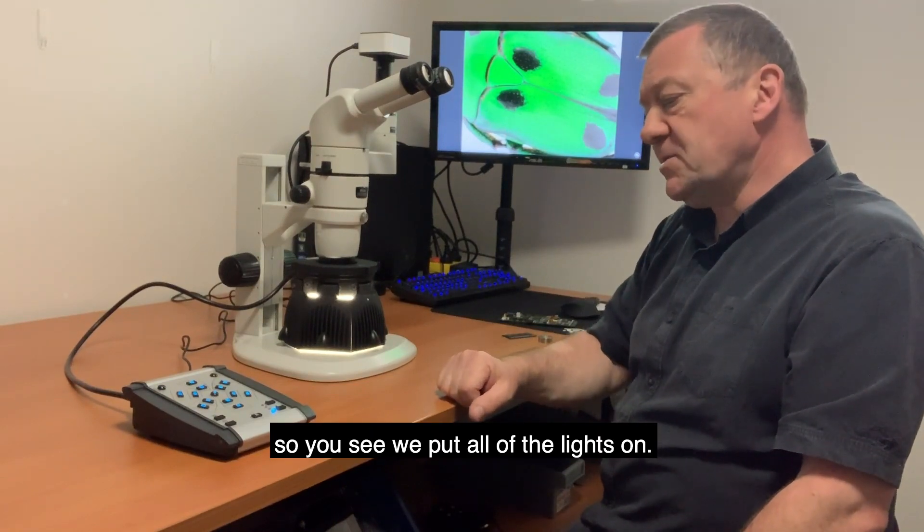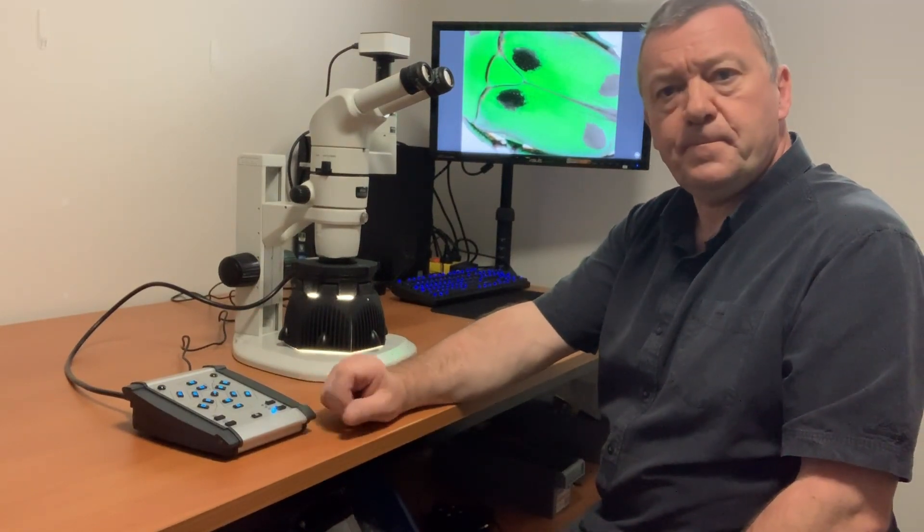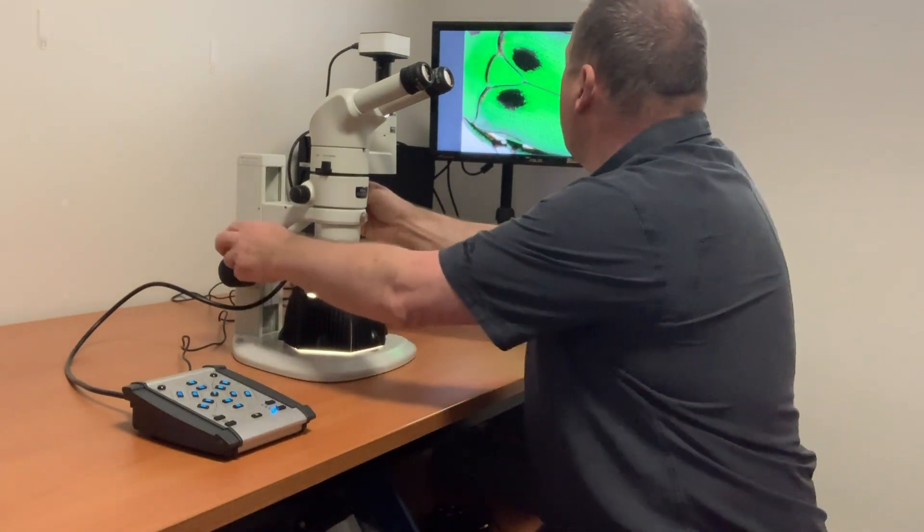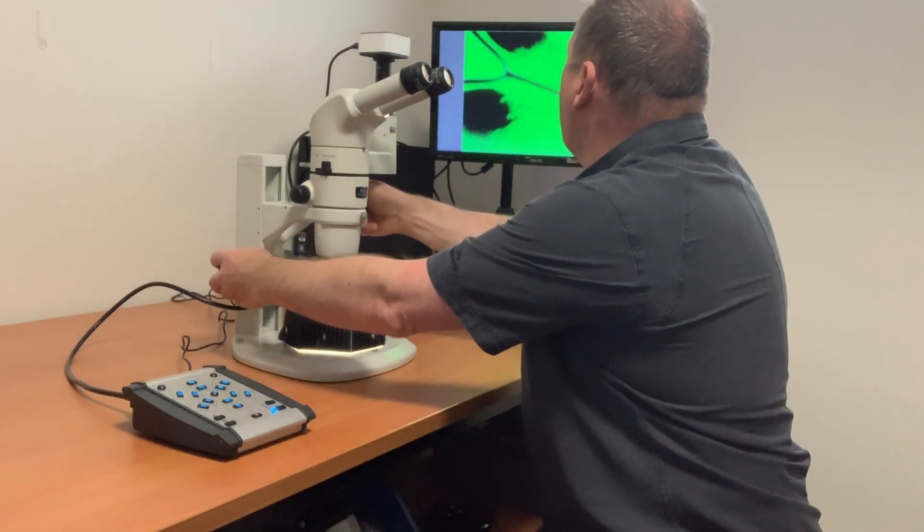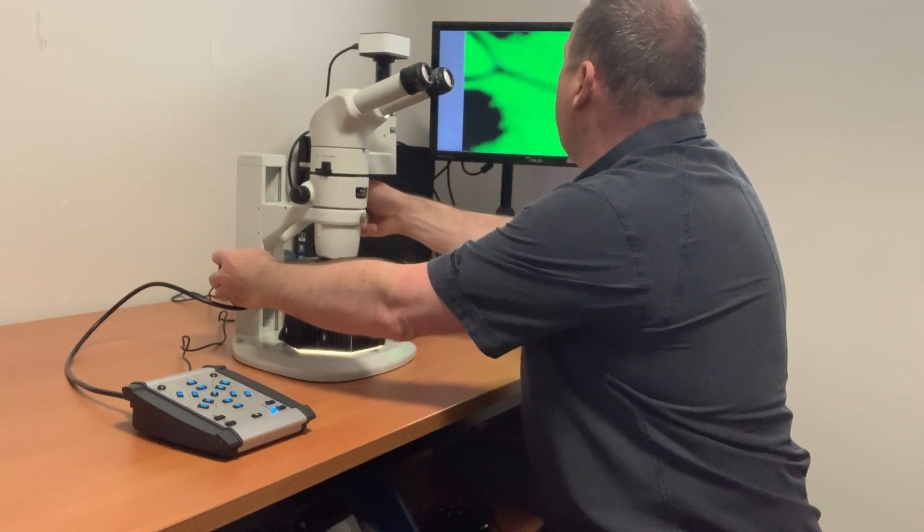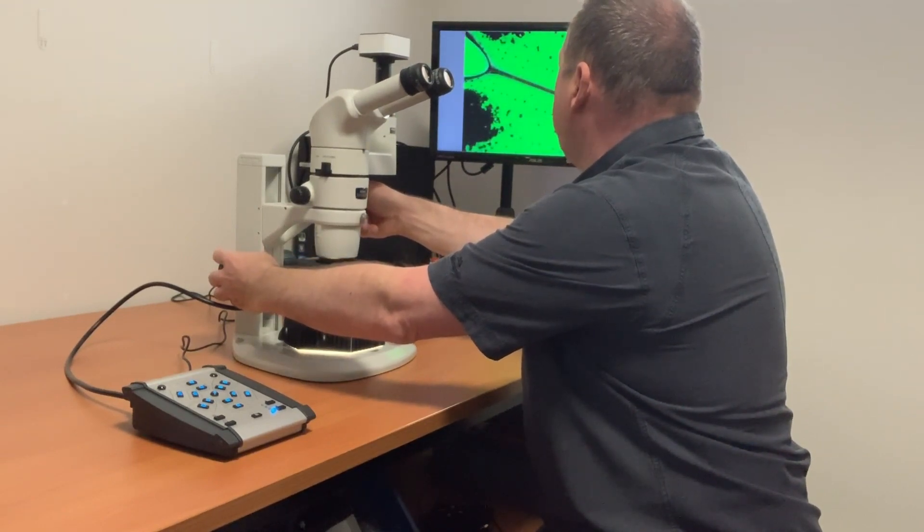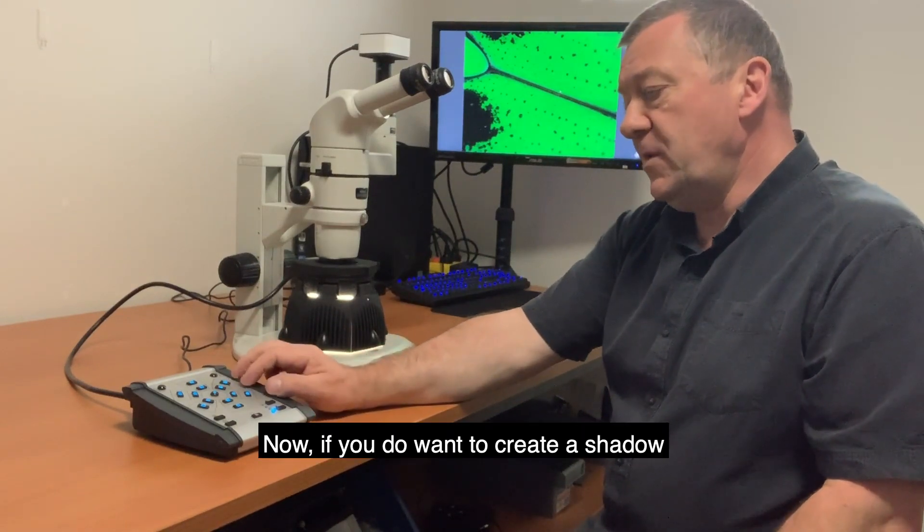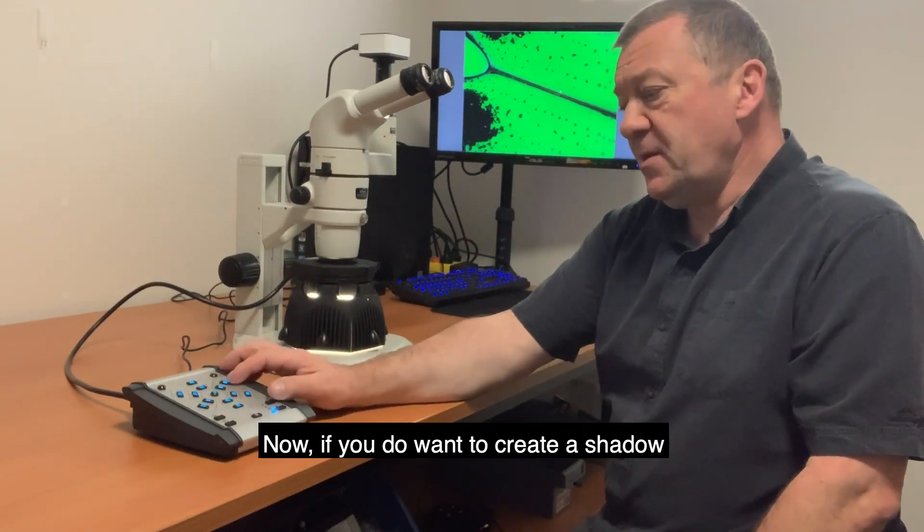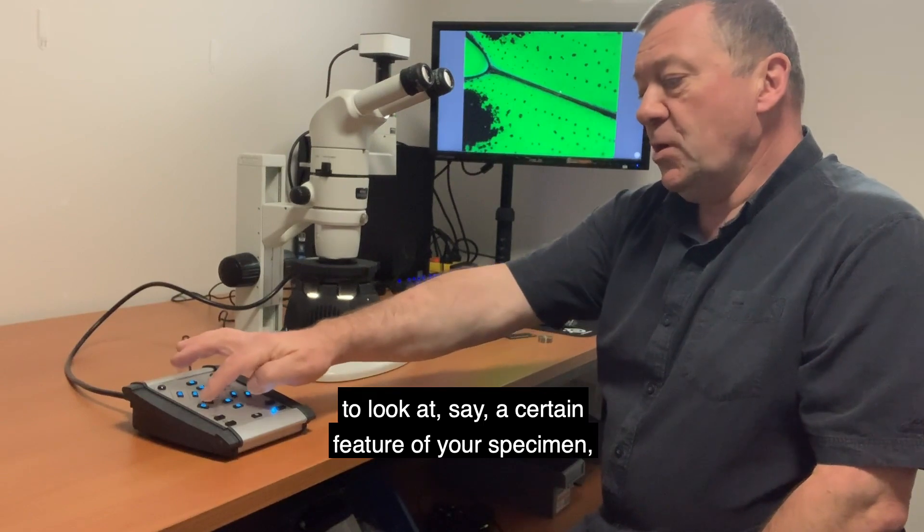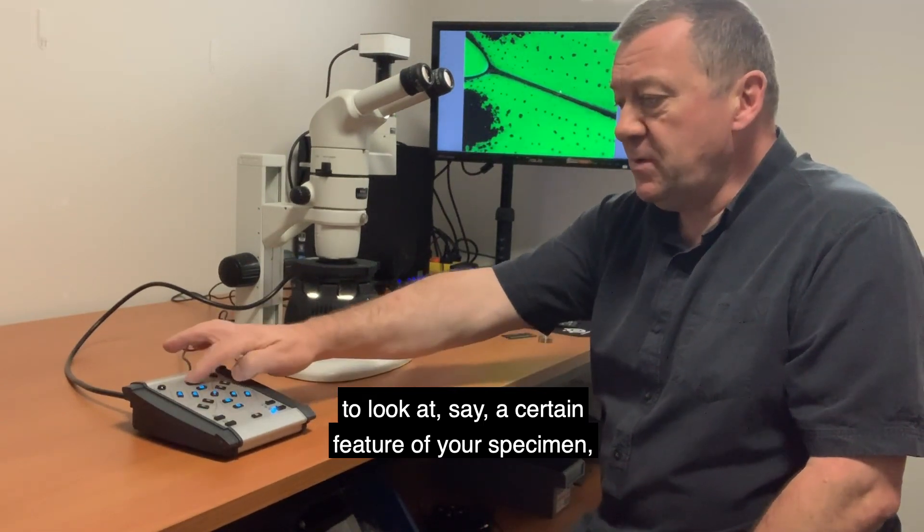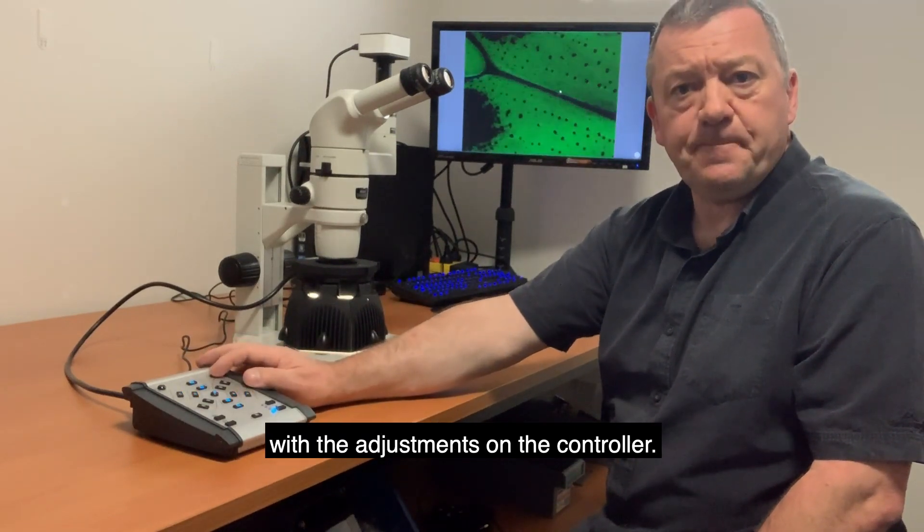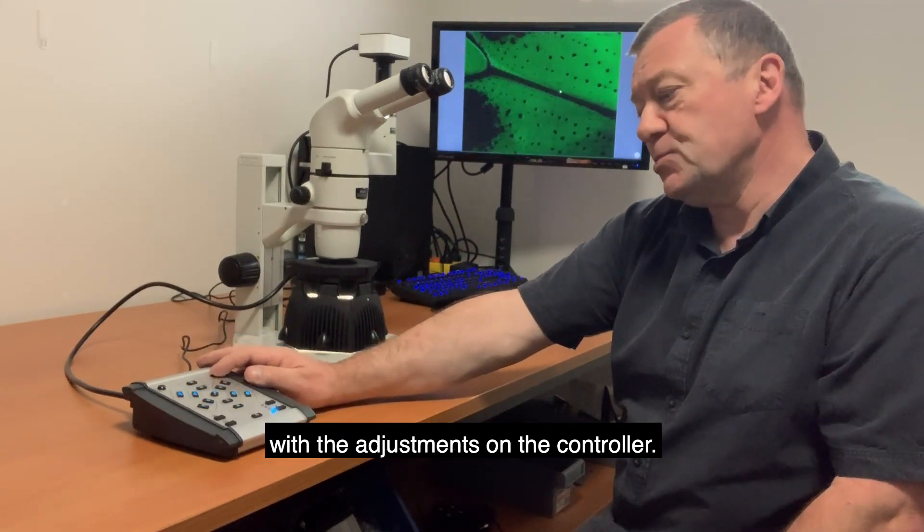You can see if we put all the lights on. Now if you do want to create a shadow to look at a certain feature of your specimen, this is completely controllable with the adjustments on the controller.